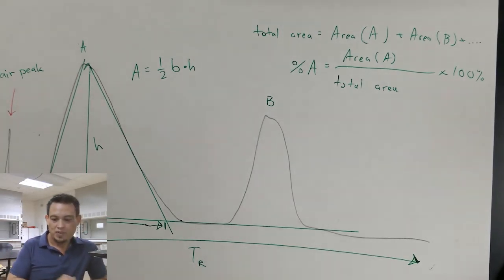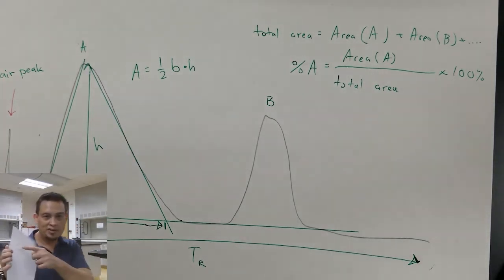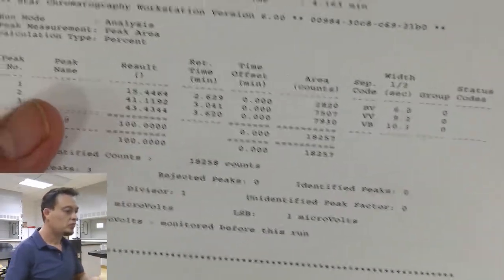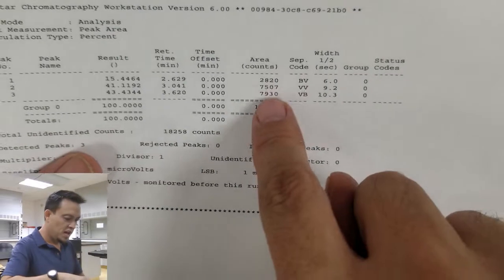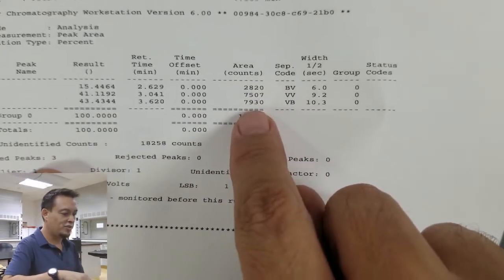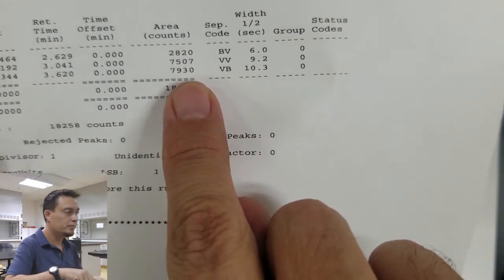the data for that. What you are going to have the data for, though, is the actual data that spits out from the instrument. So I will give you guys a screen capture of this after the actual data is collected, but I just want to show you what it looks like here. So this is a report from the instrument. Here are the results, or retention times, and then the area counts. These are unitless on here, but we're going to use them as if they're areas here.